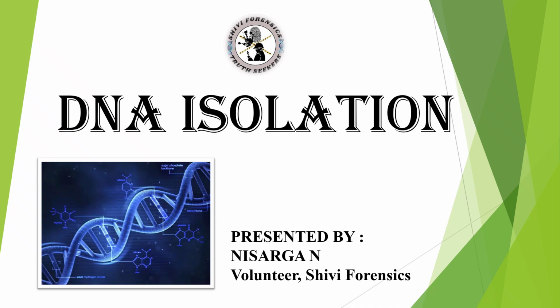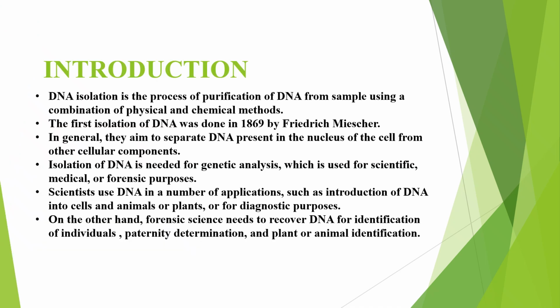In this presentation, I'm going to cover the basics and steps of DNA isolation. Without any further delay, let's get started. Let us begin with the introduction first.